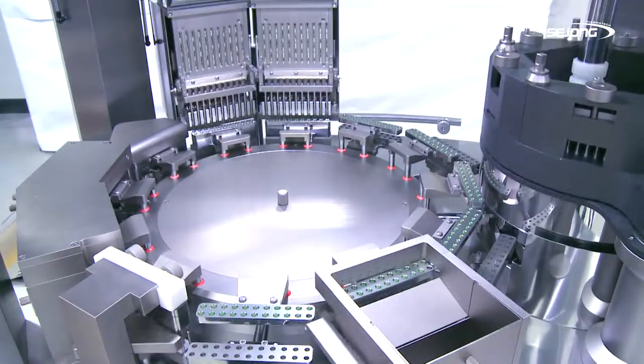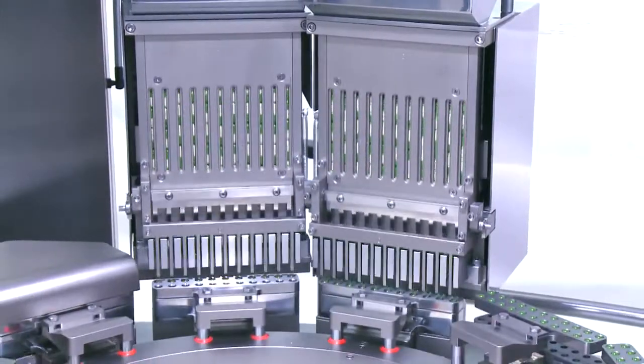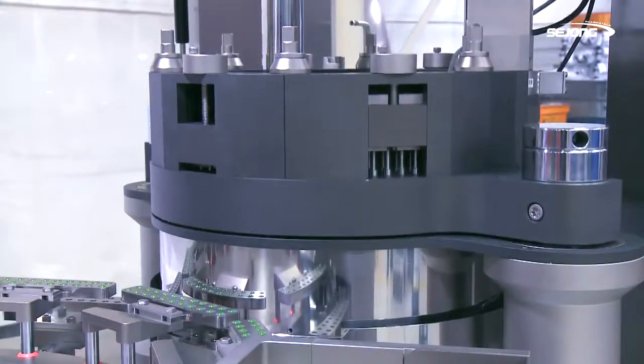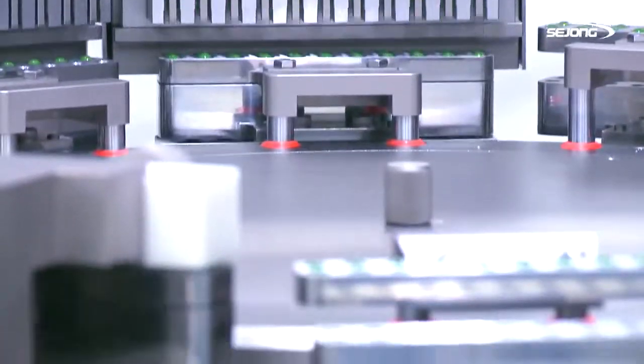By adopting the index and cam drive method, it significantly reduces noise and vibration. Rotary Motion by Index delivers capsules in a way to allow each part to maintain its own function.